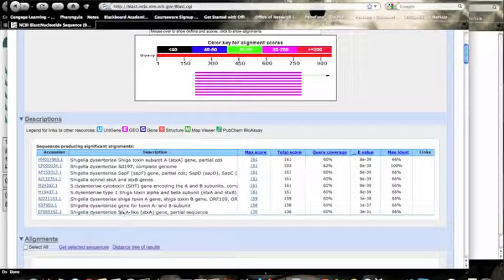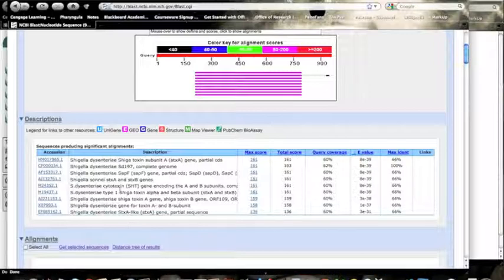And you can see that we're finding an awful lot of this toxin in Shigella. Pretty close homology. And in fact, I think there's a pretty good connection between these two organisms.